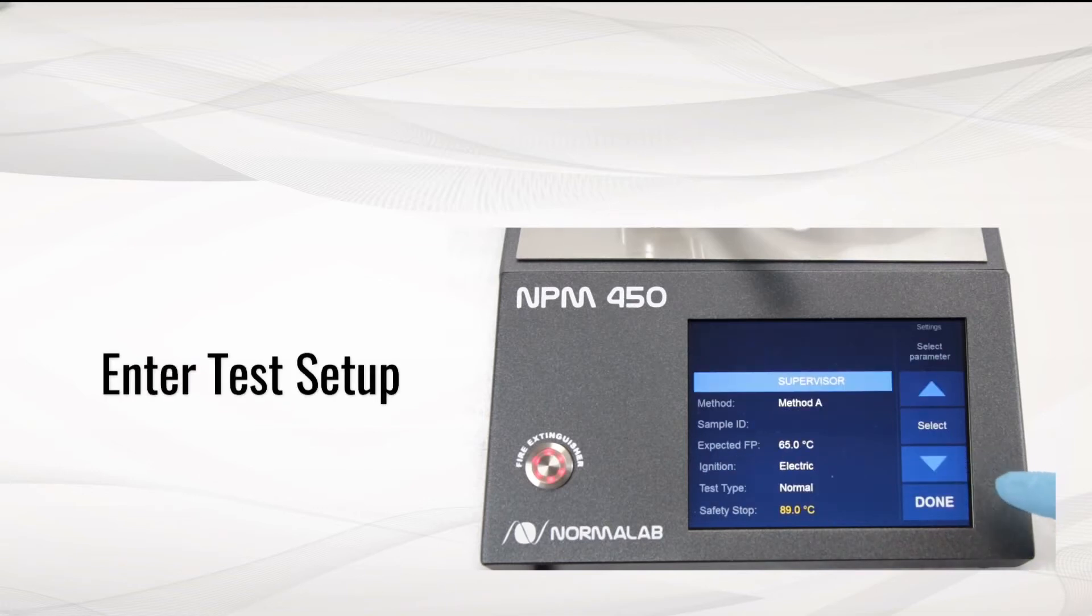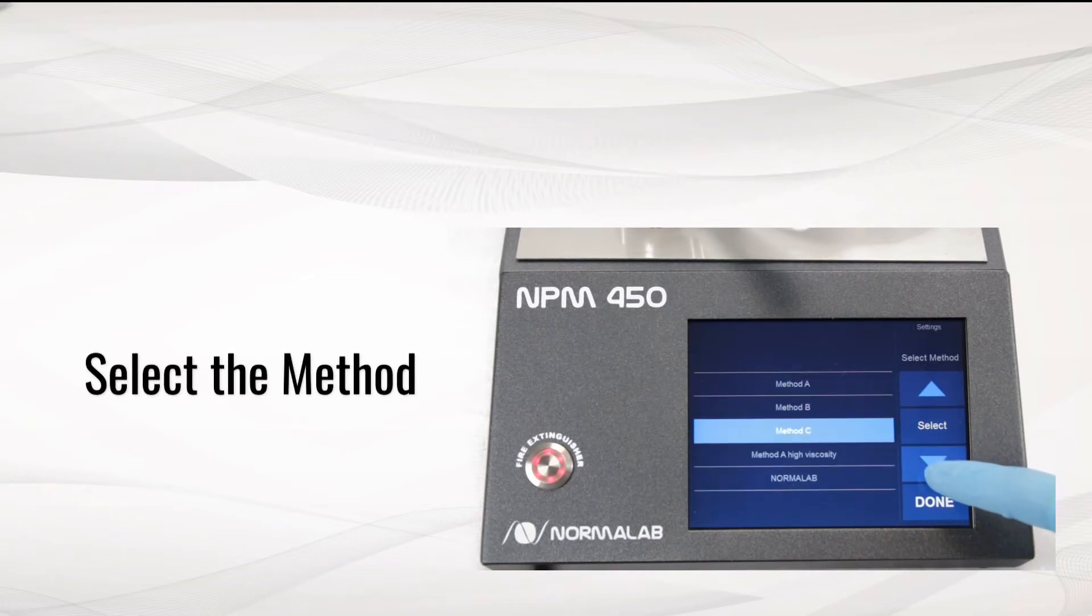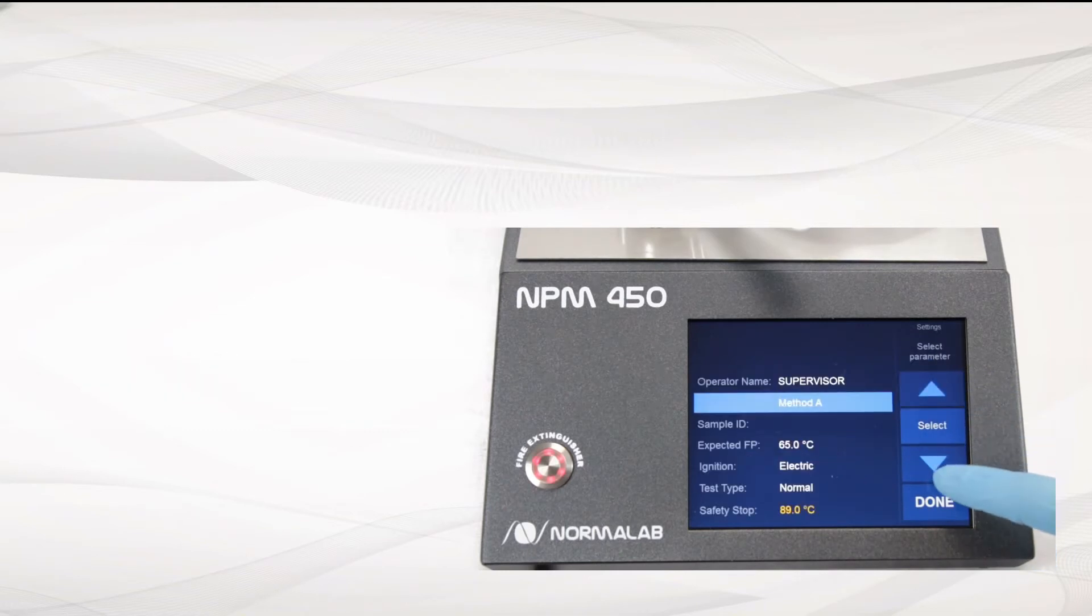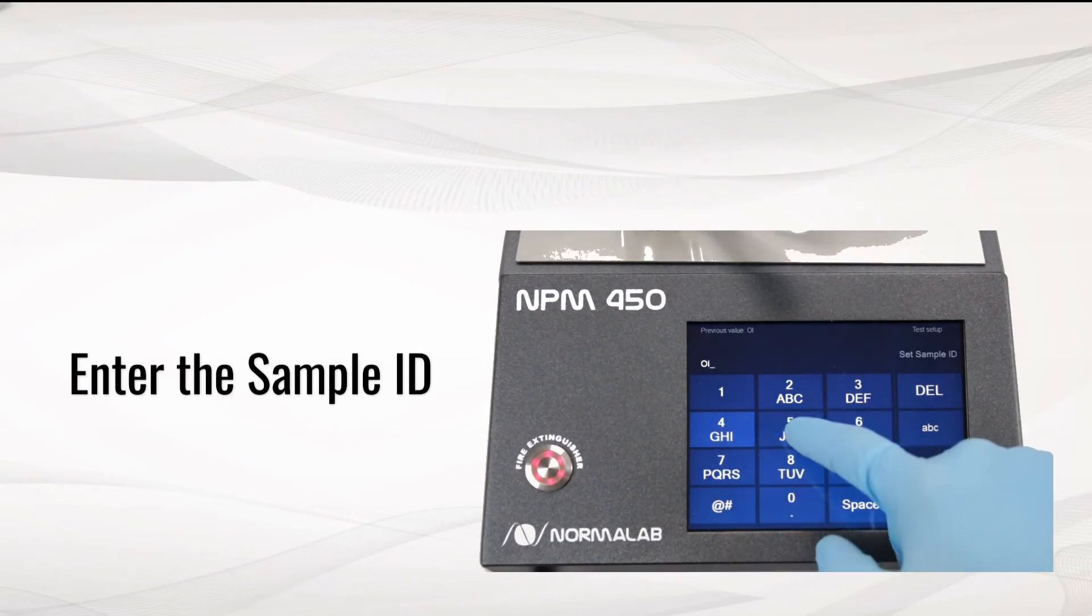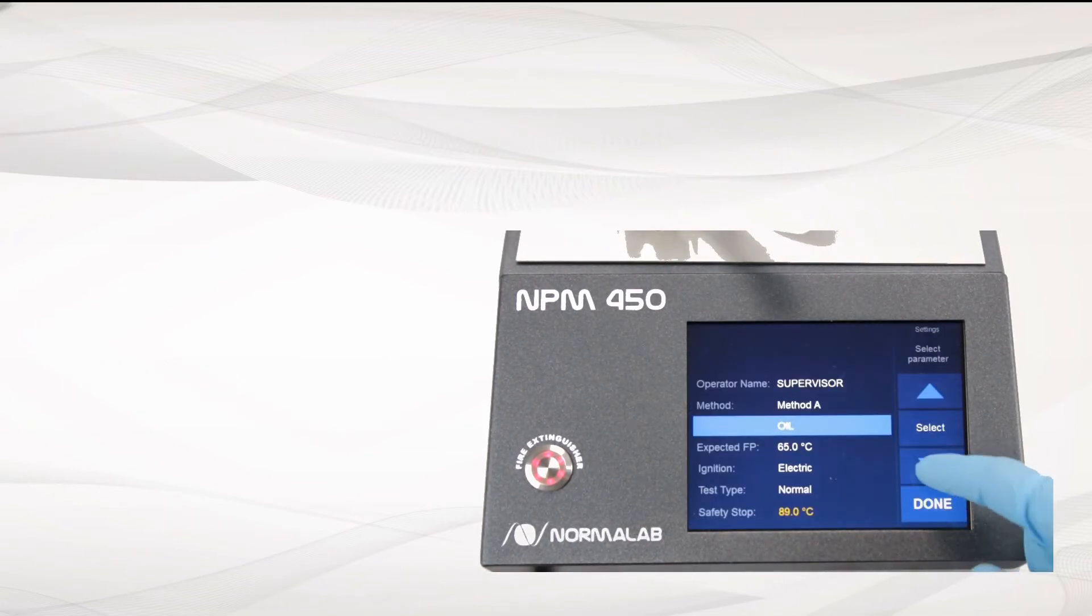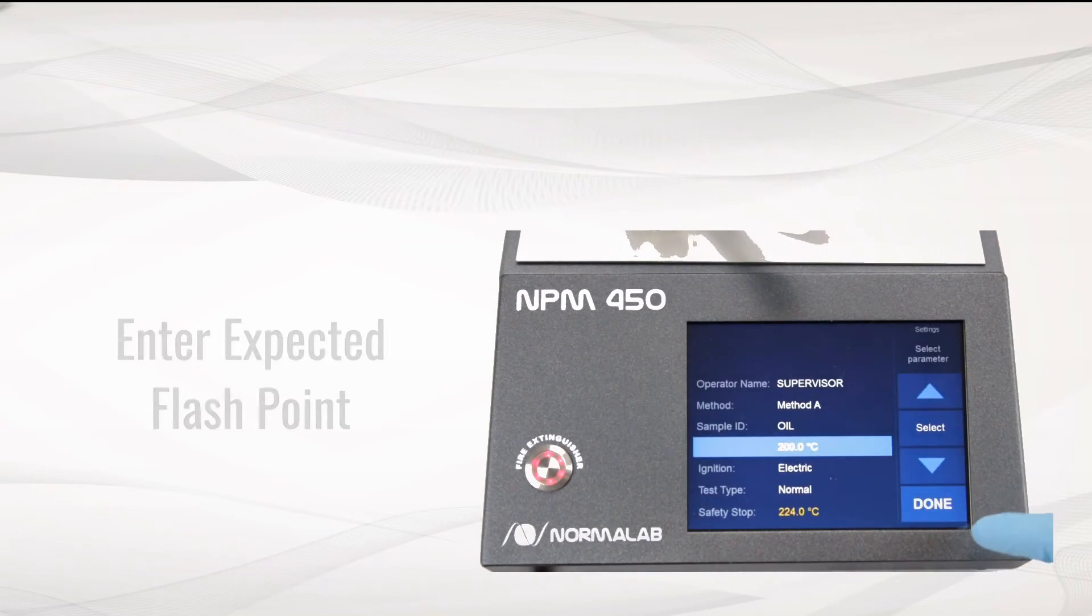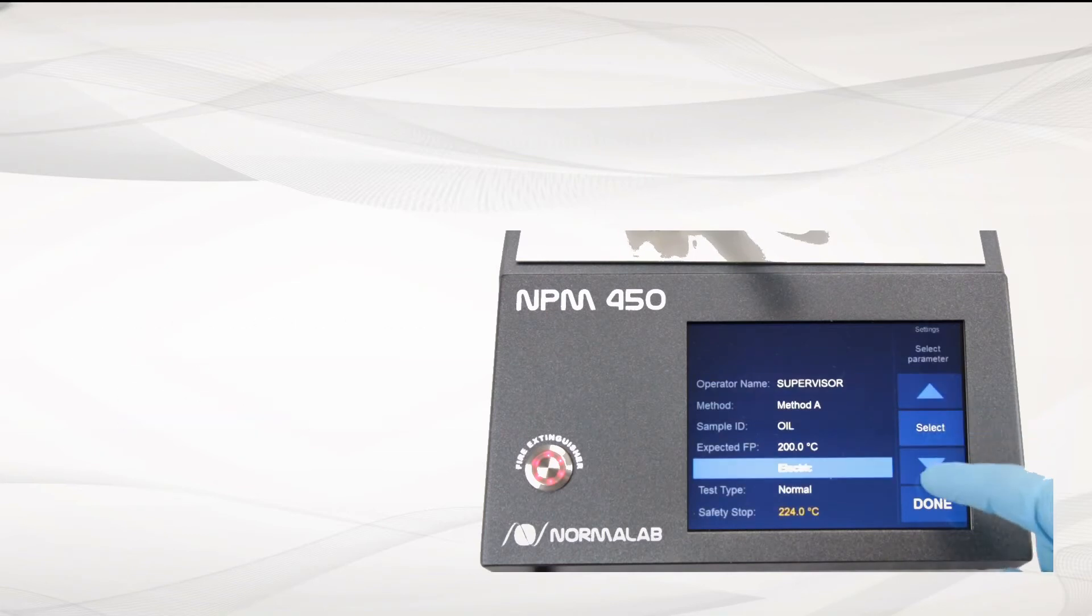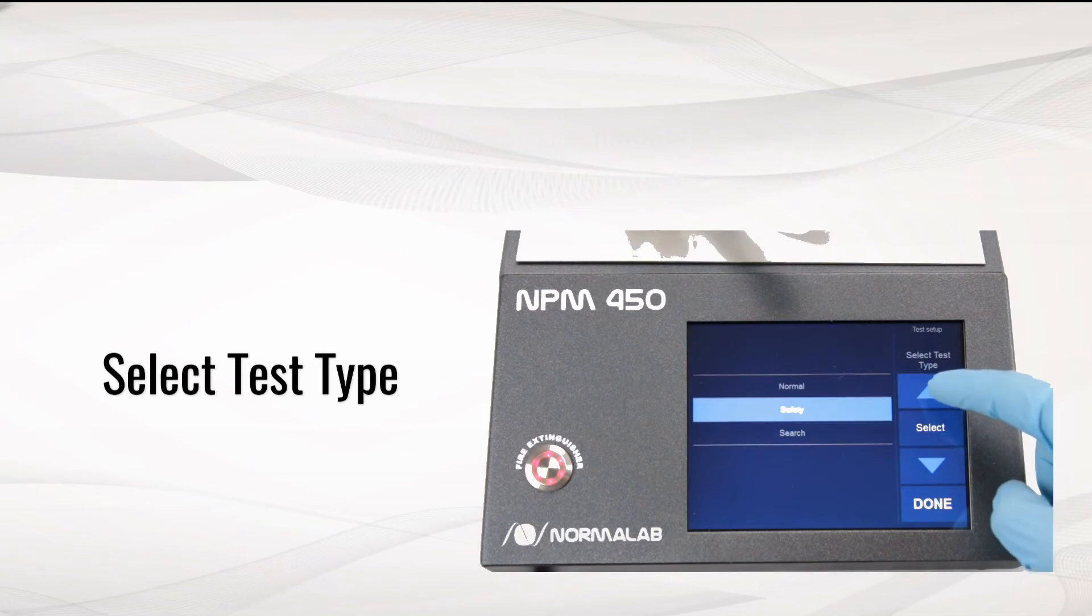Enter test setup. Select your method from the list. Enter your sample ID. Enter the sample expected flashpoint. Select the ignition type for the test between gas and electric. Select the test process: normal, safety, or search mode.